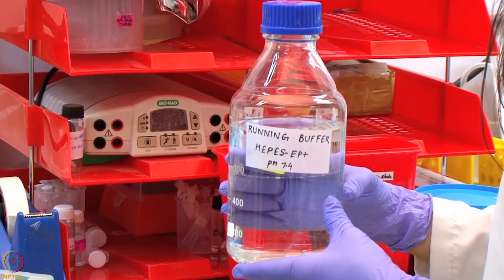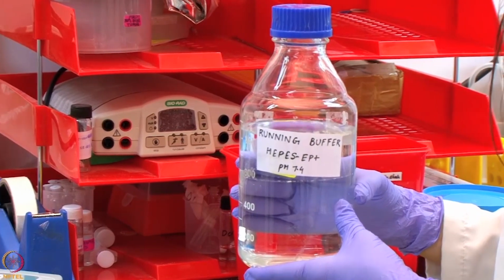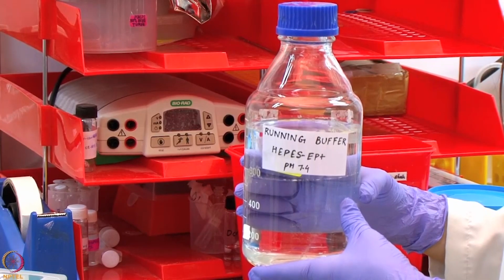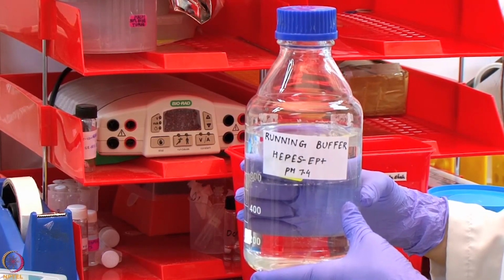We will be using HBS-EP Plus as the running buffer, which will be connected to the system prior to the initialization of the immobilization run.